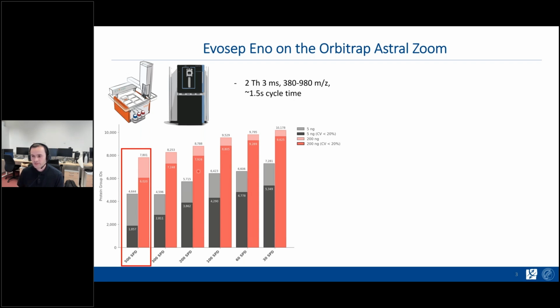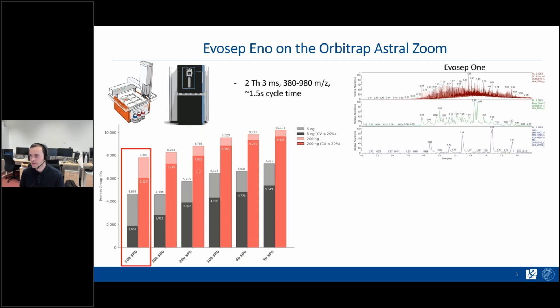And the reason is, as Nikolai explained earlier, and also Ulysses touched upon a bit, that back on the Evosep One, there was quite some tailing and broader peaks for these shorter methods on the 500 SPD. So here on the right side, I've plotted the TIC as well as the base peak chromatogram, and here a selection of 5 peptides over the gradient length.